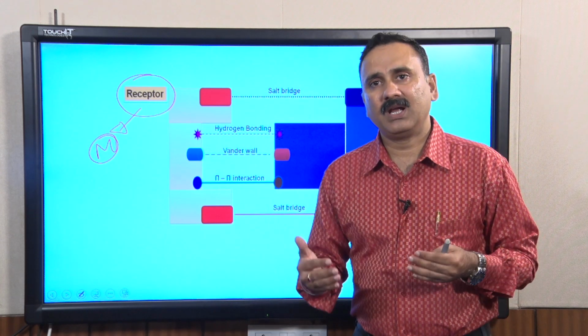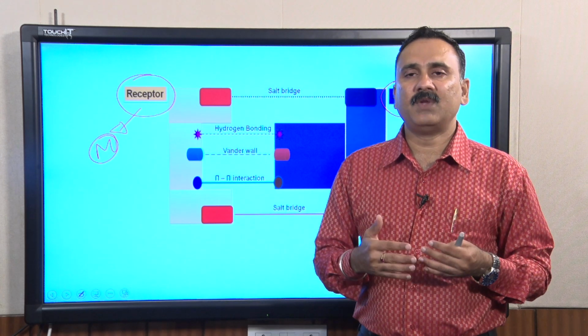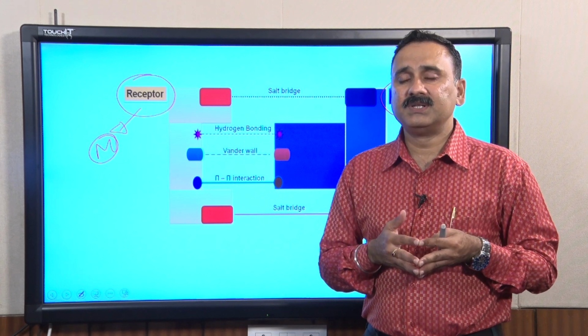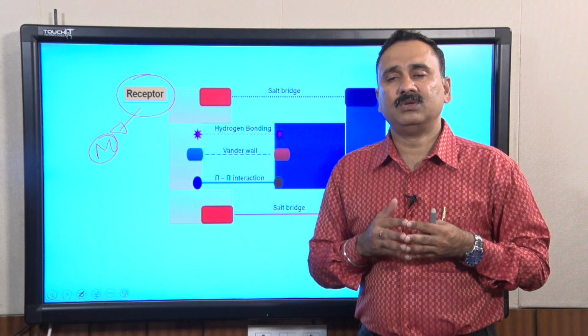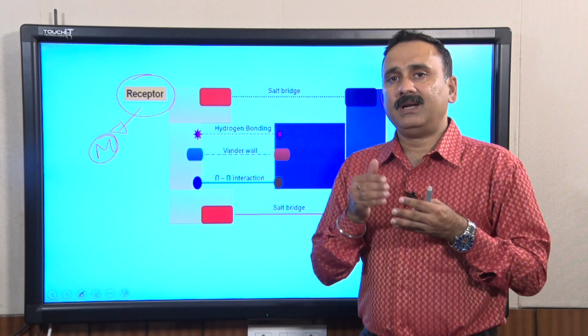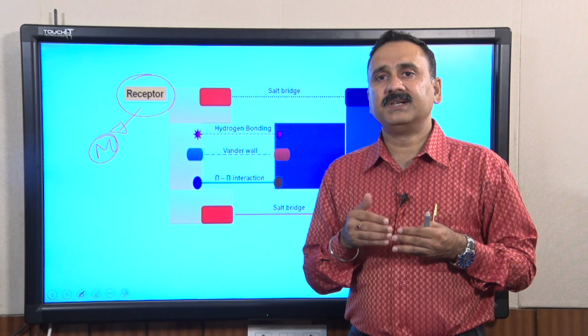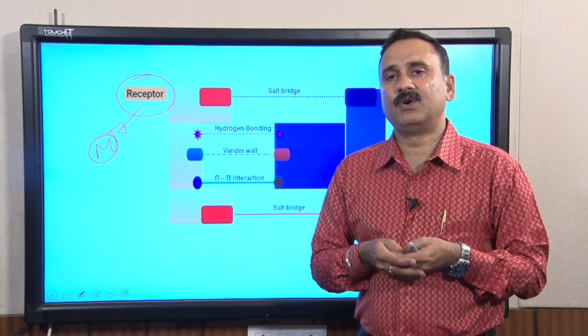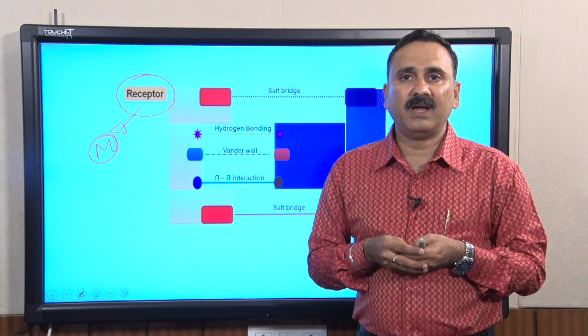In our subsequent lecture, we are going to discuss how to generate the receptors, how to couple these receptors to the matrix, and at the end we are also going to discuss the purification, what the different steps are that you have to use for purifying the protein.